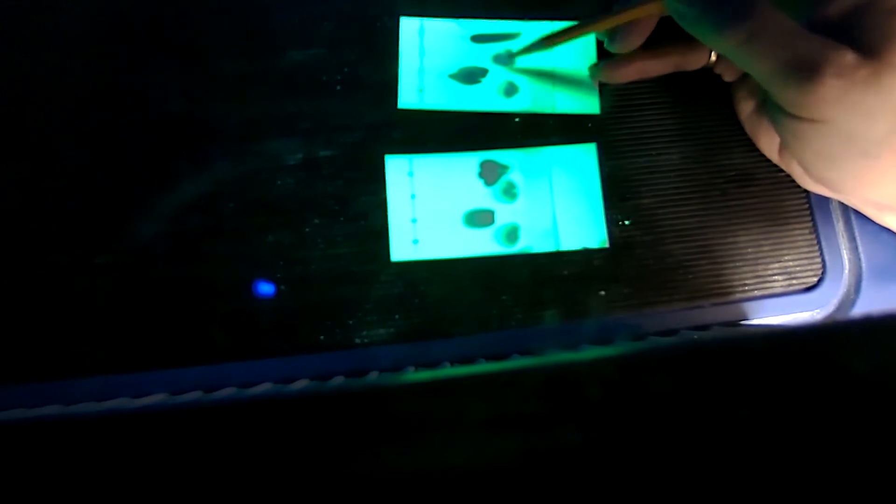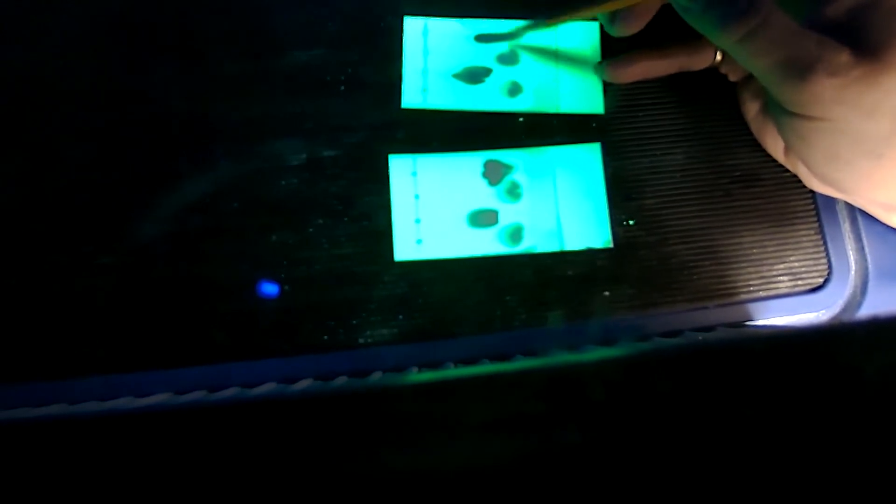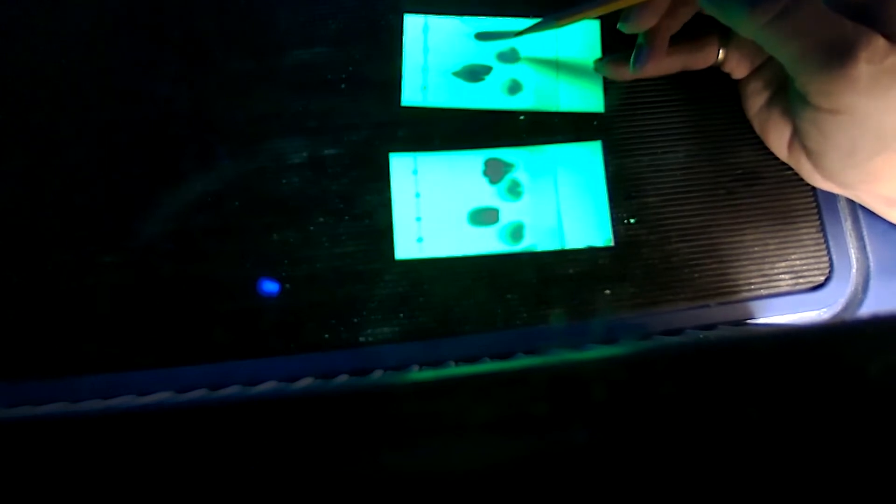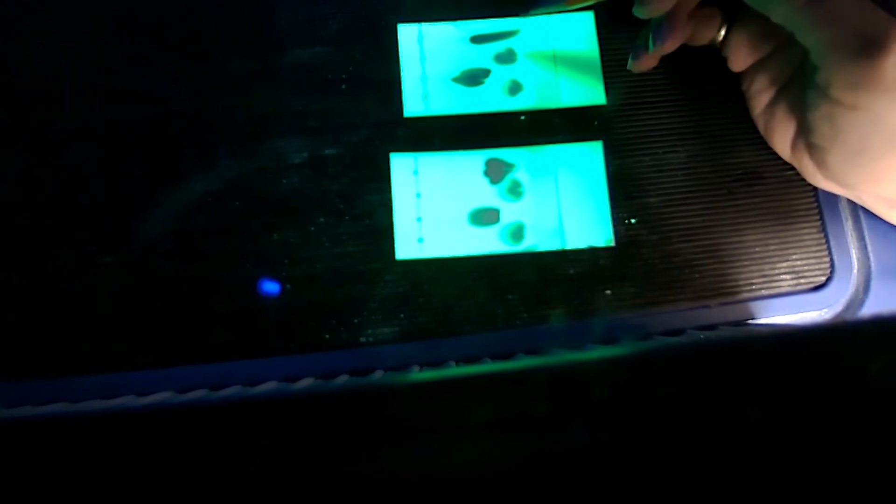And fortunately the size of the drops, they were not too big, because if they are too big then they are going to kind of submerge, they are going to combine the two samples together. And then it would show as like one bulky spot there, one big spot there, which makes it impossible to calculate or to measure the distance.